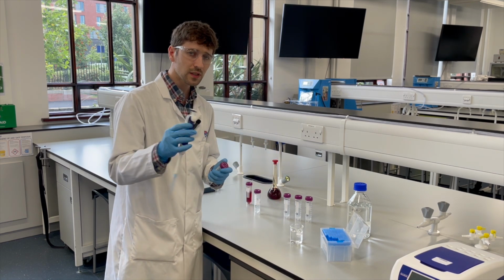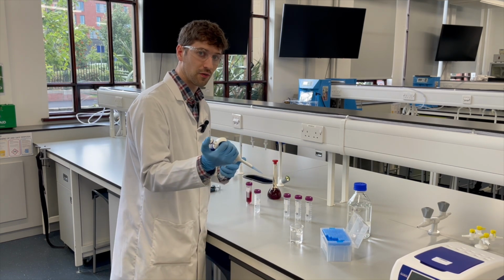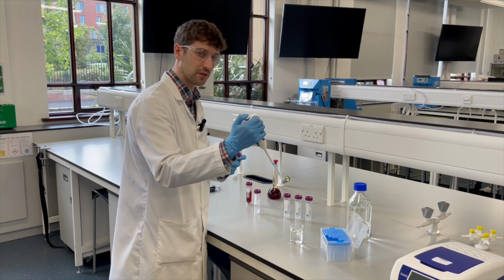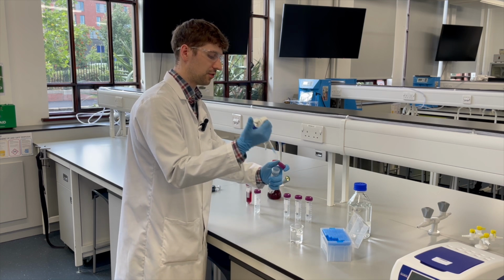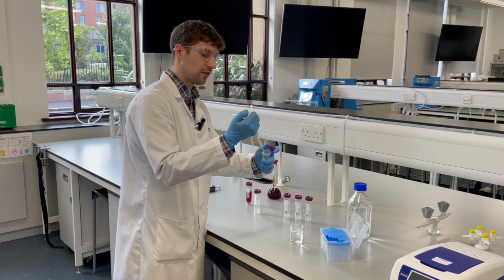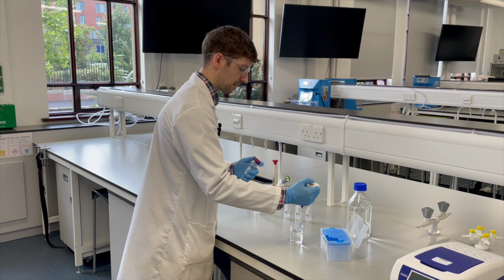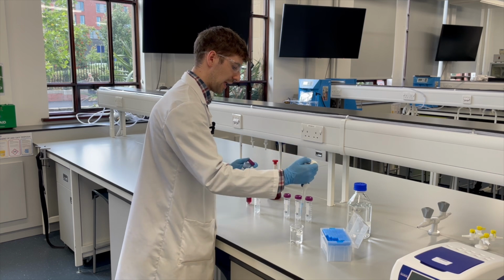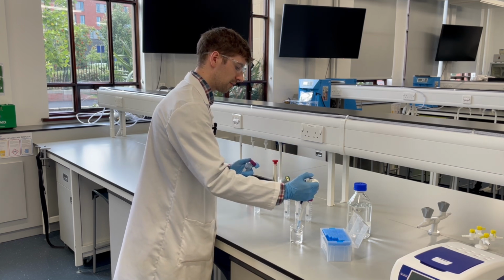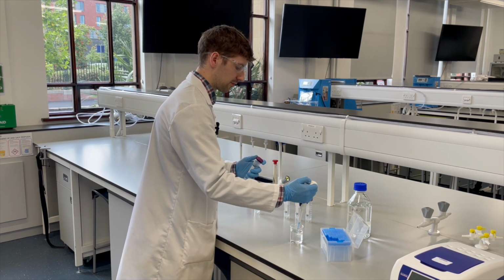One other tip. When you're using your pipette, you'll feel that there's 2 stops, okay? To withdraw volume, okay, you push the plunger down to the first stop, place the pipette tip into the solution, and withdraw slowly, okay? And then to eject that volume, you go through the first stop and into the second, okay? So that's 1, 2, so pushing the plunger down, then into the solution, withdrawing, and ejecting. 3 and 4.